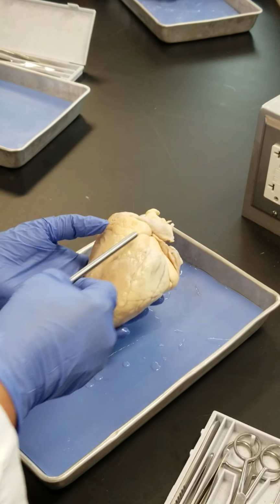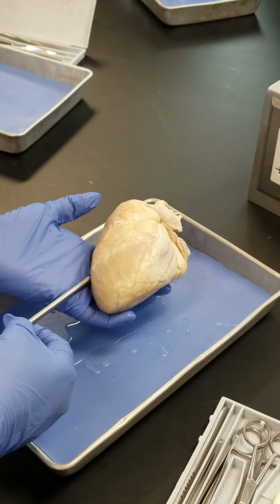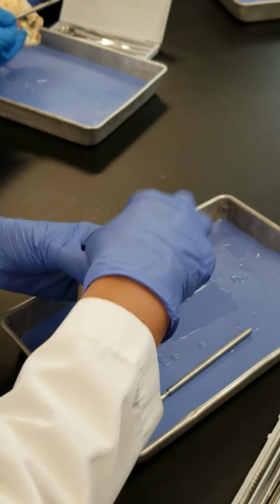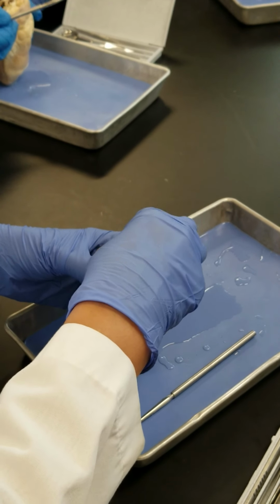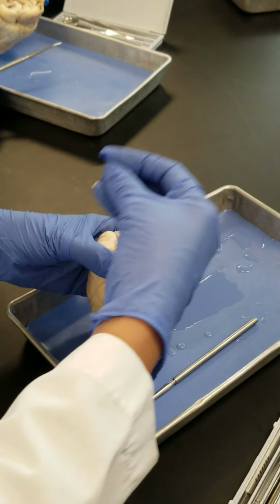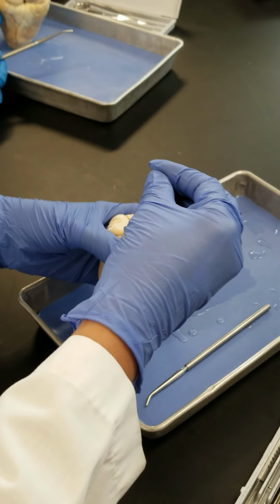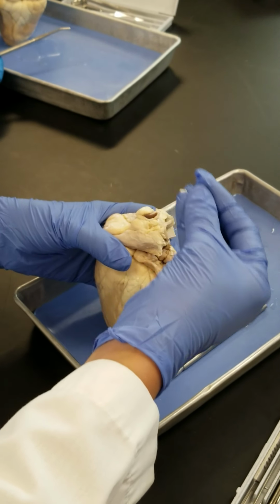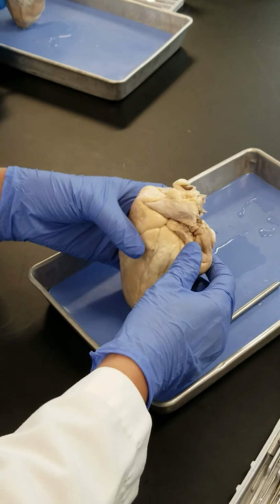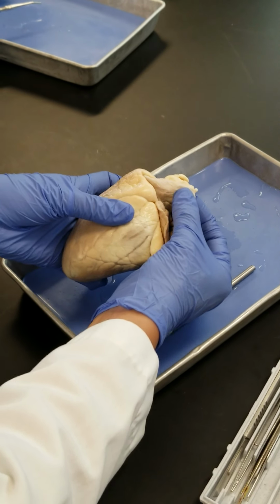After you recognize which side is anterior and posterior, you can name this anterior or posterior, right? So the clue is all about these vessels that are coming out of the heart, or in other words, they are connecting. Some of them are bringing the blood out, some of them are bringing the blood inside of the heart, right? When a vessel brings the blood out of the heart, we call it an artery. When the vessel brings the blood inside of the heart, we call it a vein, right? Now, when you look here, you see a big vessel here, this one, right?